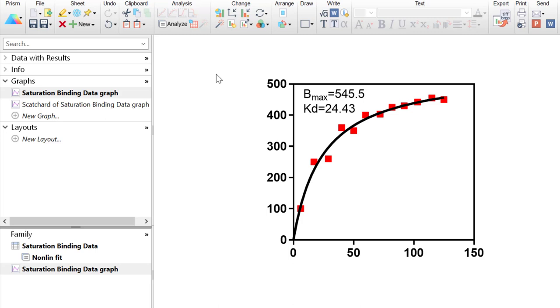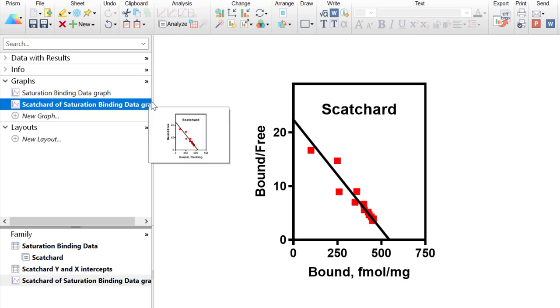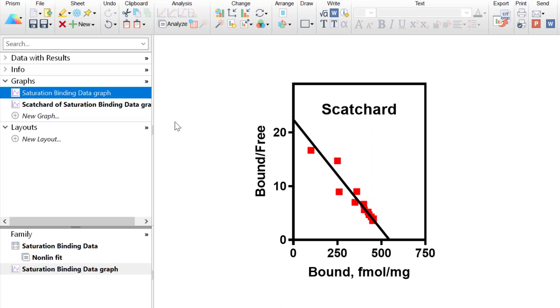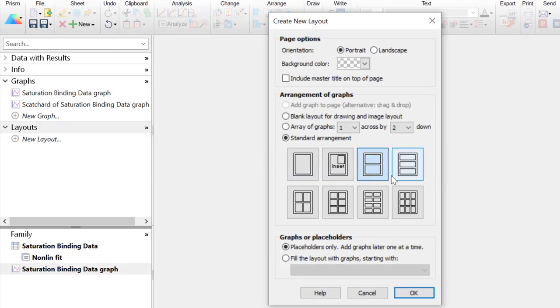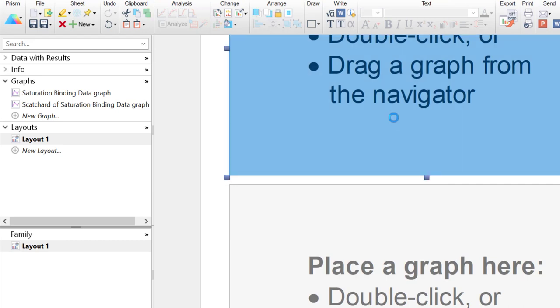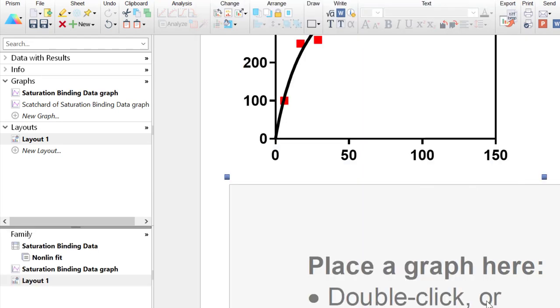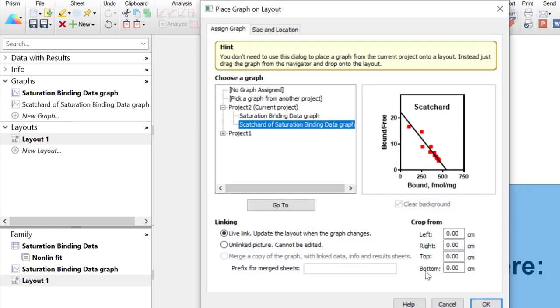Another useful thing you can do in a layout page in Prism is combining multiple graphs into one. I have two graphs already created — imported from the graph portfolio specifically the file called 'how to combine graphs in layout'. The first graph presents saturation binding data and the second is a scatterplot of the saturation binding data. I want to place a smaller version of the second graph inside the empty space of the first graph in the lower right, so I'll create a new layout page with two placeholder graphs above and below, inserting each graph into its respective placeholder.